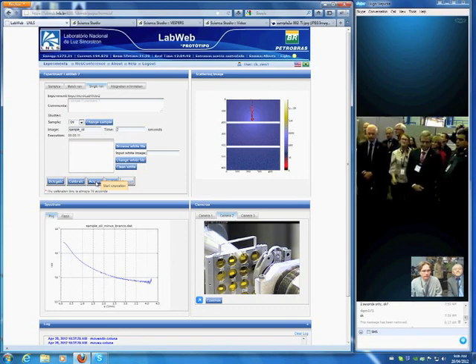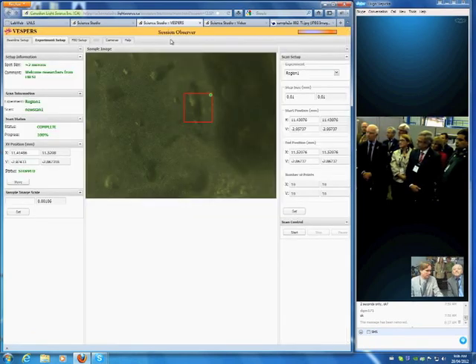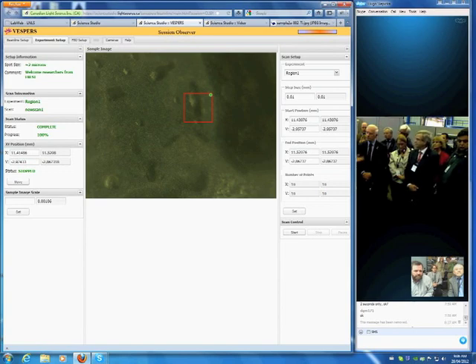Now, this was a prototype. We had a local company here with a group that did this. And once we wanted to move from a prototype to a real system, we studied different options of systems being employed on different platforms that synchrotrons are for. In fact, you can count on one hand the number of initiatives like that. And the Canadian Light Source had an initiative which they call Science Studio. We found out that it was a mature and robust system, right? So instead of developing a new system from our prototype, we decided to put our forces together in a single system. So now we are porting our system to the single platform, and we hope it will be used in other places also.